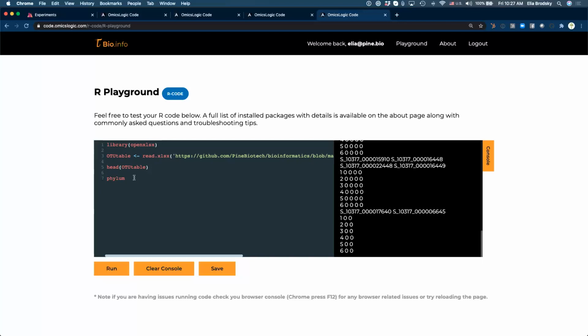Okay, let's store our phyla names. So we'll call this factor, out of the OTU table, and we're going to take this from that first column.